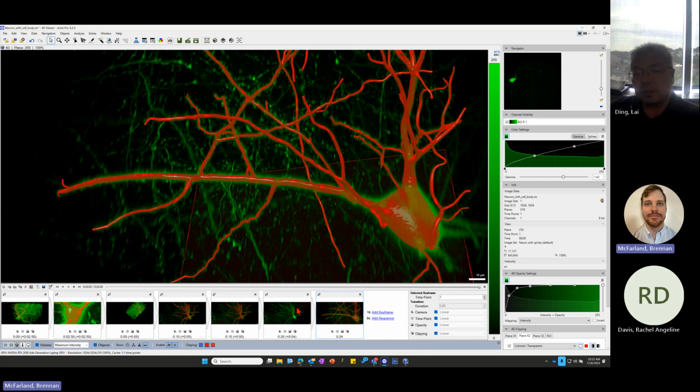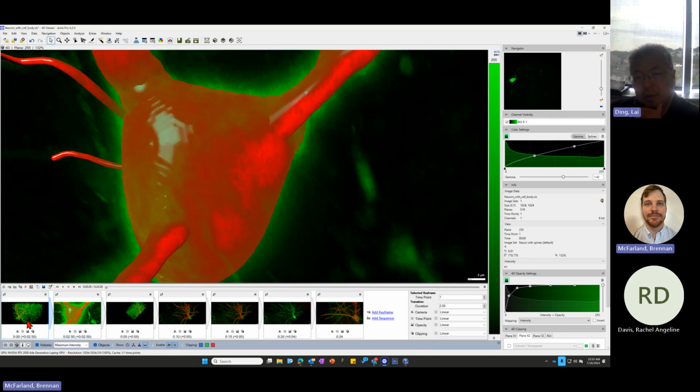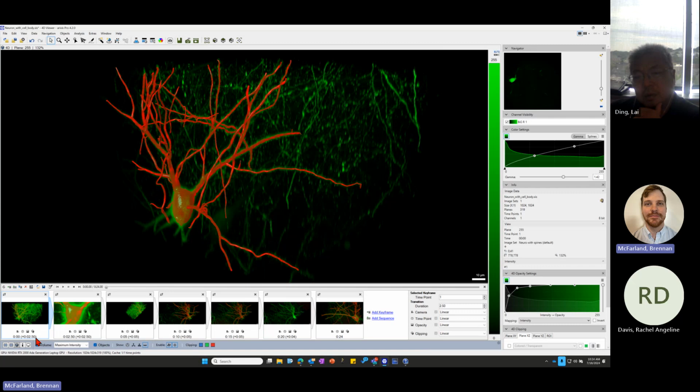The options here are that they kind of give you, think of yourself as a director. It's just total personal preference. If you want to go from this point to this point, do you want to go really smoothly? Or some people may say, I want it to zoom in really quickly and then slow down in the last couple of seconds, because some people don't want it to move just linearly, and maybe they want emphasis.